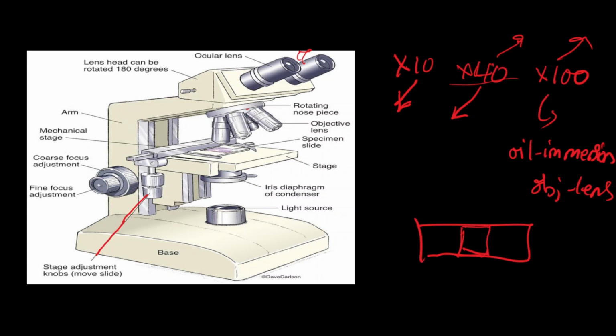Okay, the cover slip basically covers the actual section of tissue to be viewed. Now it's possible that the slide is placed and the tissue to be viewed is not directly on the aperture. The light is not exactly getting into the tissue, or the tissue is not able to be viewed from the optical lens. So we could use the stage controller to adjust the position of the slide from left to right or top to bottom, as the case may be.